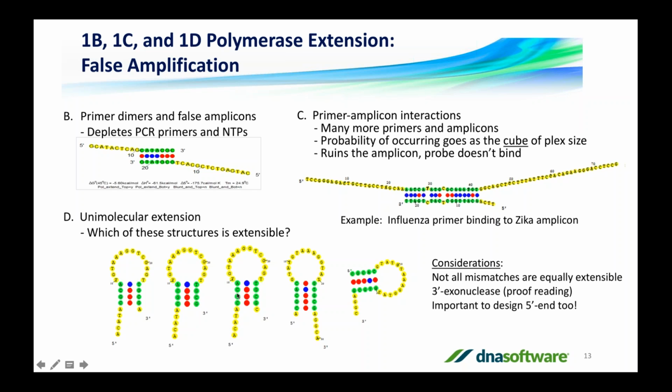On the other hand, this primer over here in the middle that differs by 1 nucleotide, it's changed the C at the end. Now it's an AC mismatch. Well, an AC mismatch actually is, many polymerases find that to be tolerant, and they will extend that. And once they extend that primer to the end, that primer has now changed its chemical composition and will no longer be viable in the PCR reaction.